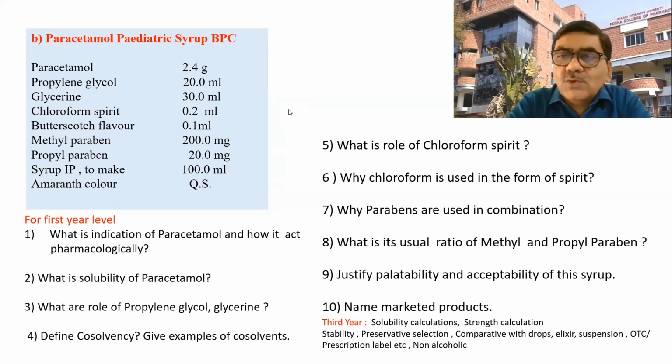So solubility of a drug in water and solubility of a drug in a syrup. In which case will it be more soluble? We discussed this in the first practical only. So here, what is the solubility of the drug in the syrup? What may it be, and whether it will be improved by propylene glycol and glycerin or not.